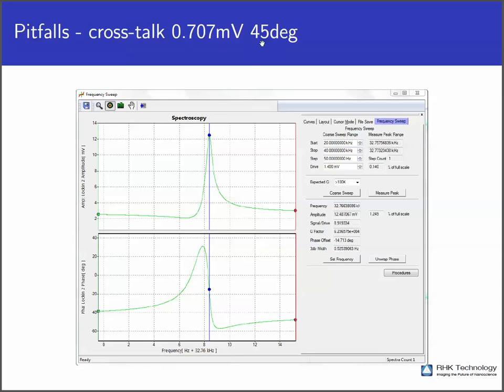If you play with this a little more, you get the right amplitude a little bigger, the phase a little better, then your phase will suddenly look like an amplitude peak, and your amplitude peak will suddenly look like a phase peak. The thing is, if your phase accidentally hops over this peak here, then on this side the polarity of your phase feedback loop will be inverted and your phase will wander away. The same here. If you go beyond this peak, your phase will wander outside of the picture. So the frequency control loop is only stable between here and here, between those 2 points.